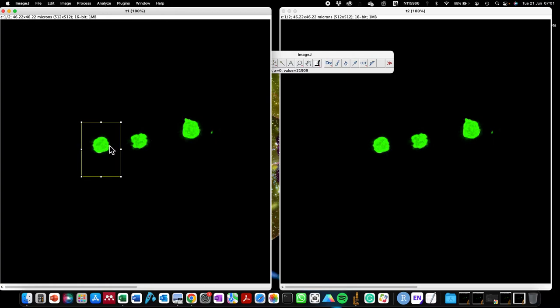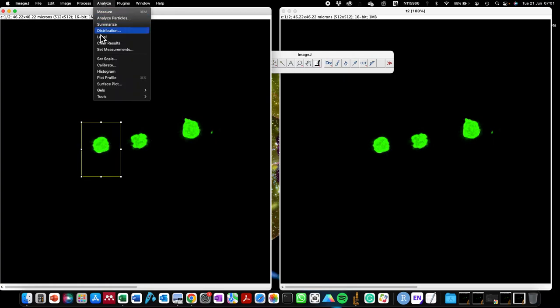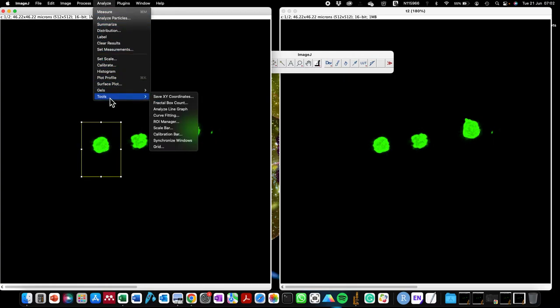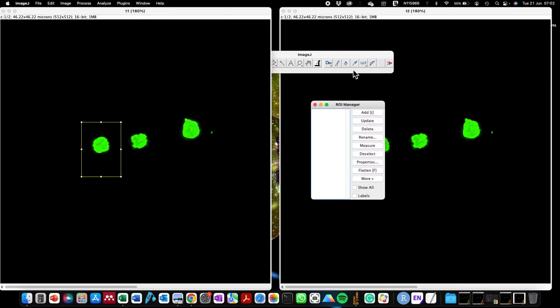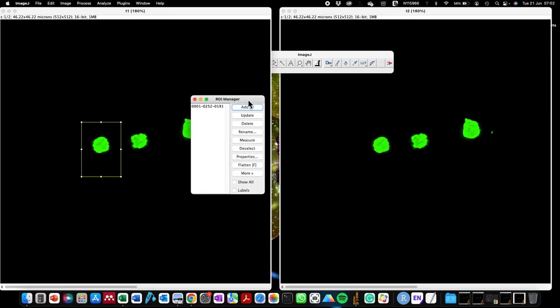I also want to draw this region of interest on other areas of this image. To first save the memory of this region of interest, I'm going to go to Analyze > Tools and select the ROI Manager. You can either press the letter T on your keyboard to add this to the ROI Manager, or you click on the Add button. When you click on that, this region of interest has been saved on this image.